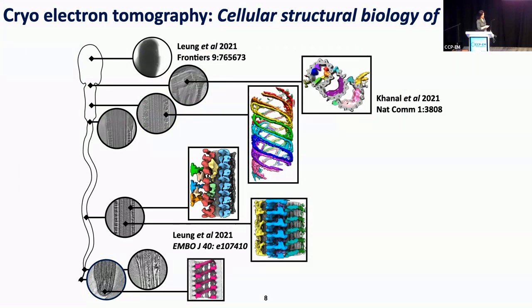And we try to average whatever possible, I think, by now in the cell. So some examples that you can see here. Some of them are related to the microtubule structure. So in the center, you will see the axoneme. This is the doublet from the axoneme, and this is a central pair. These are in the tips, you find only microtubules, and this is this average here, but also the centrioles.